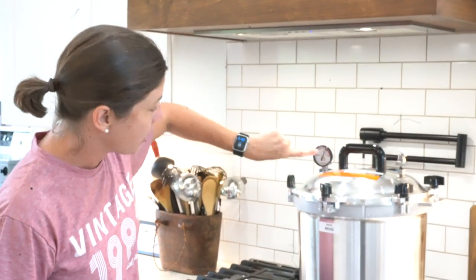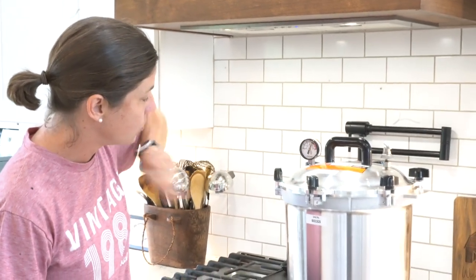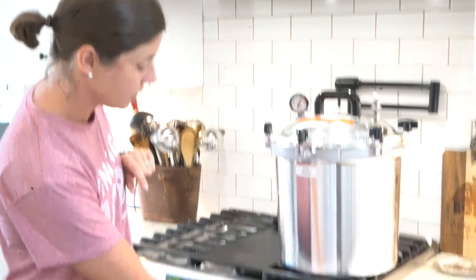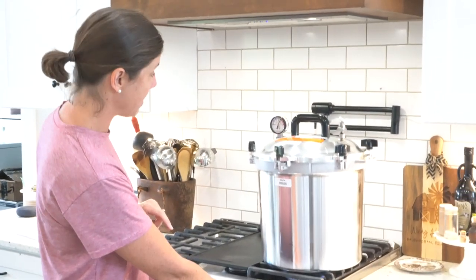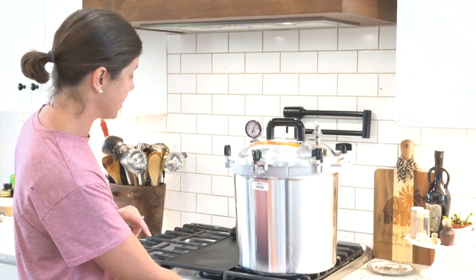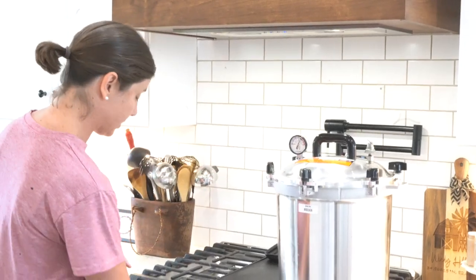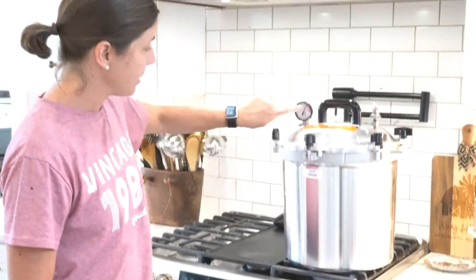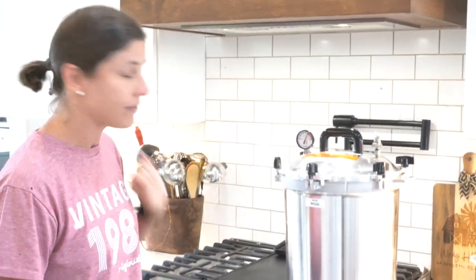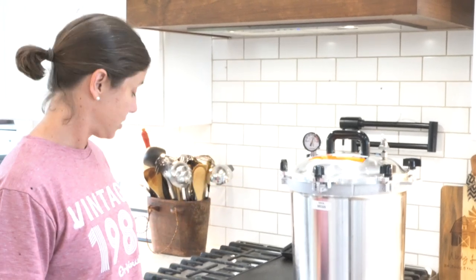We are back up to pressure. I'm going to turn it down a little — I've learned from canning that I can maintain pressure well at about medium. Now we're going to set the timer for 35 minutes and I'll keep an eye on the gauge to make sure it stays between 17 and 20 pounds. You need at least 35 minutes to get a good sterilization.